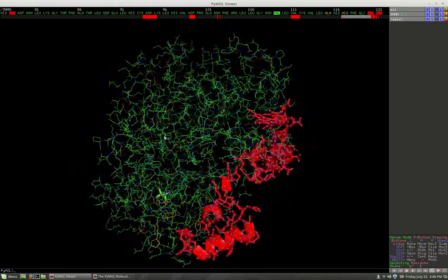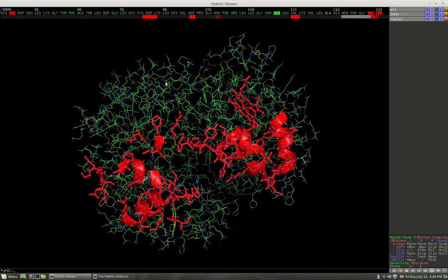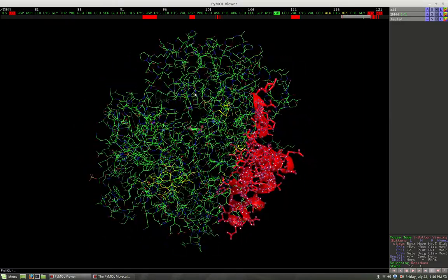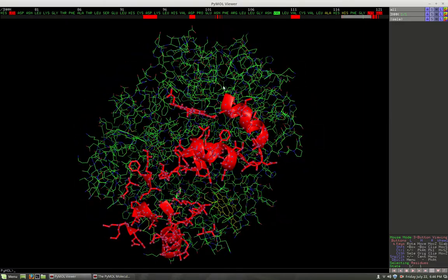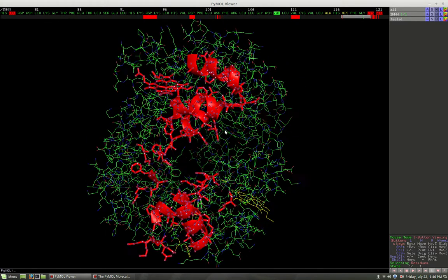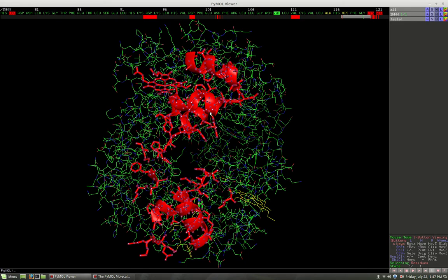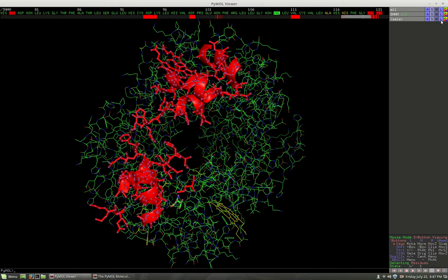Actually I clicked on everything, so what you're seeing is all of those selected residues. Well, not the heme, I didn't have that chosen, but everything else that was selected comes back with both your cartoon and your sticks. Anyway, then the regular lines are everywhere else.